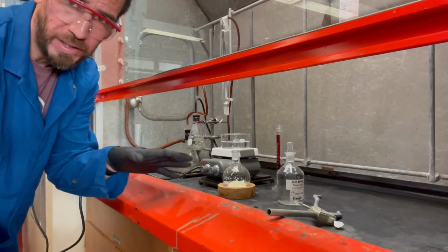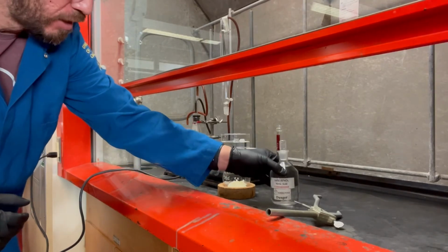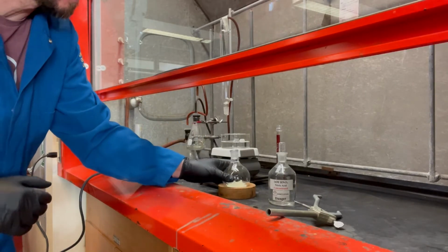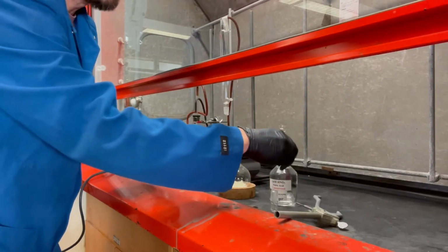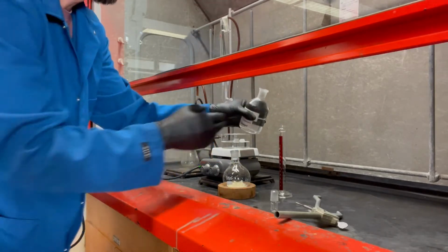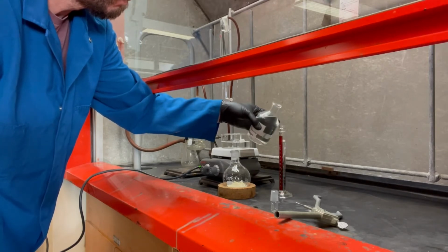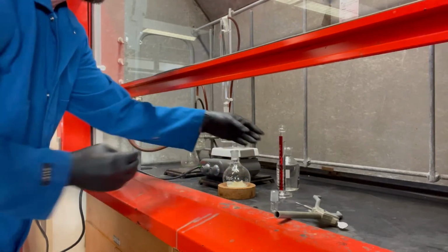All right, so what I'm gonna do now is add my 25 mils of nitric acid, boom, baby, to my Benzoin. So I gotta measure that out first. Doesn't have to be perfect. Go with my left hand so you can see that better. Add a little extra. Go ahead.